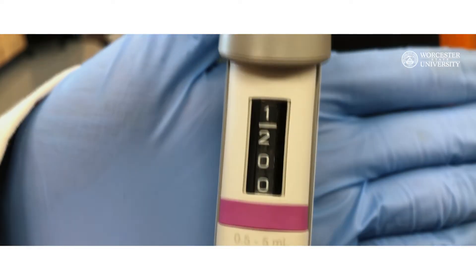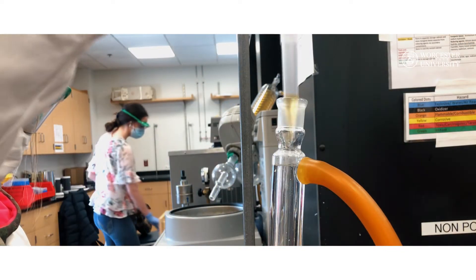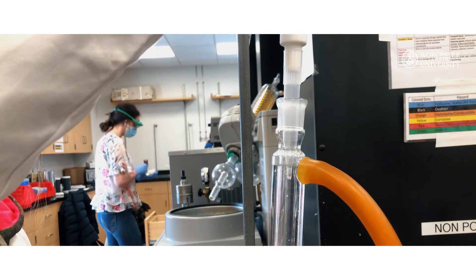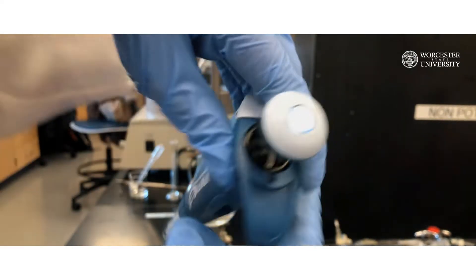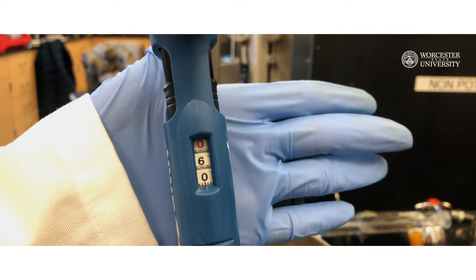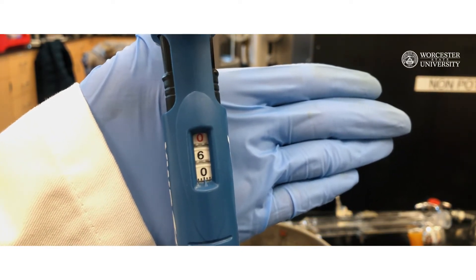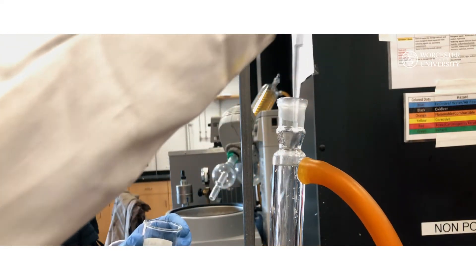Using a 0.5 to 5 milliliter micropipette, slowly add 1.2 milliliters of concentrated HBr through the open top of the condenser. If you don't have the 5 milliliter micropipette, you can instead use the 100 to 1000 microliter pipette. You will need to pipette twice, each time transferring 0.6 milliliters of concentrated HBr to the flask. If HBr sticks to the wall of the condenser, rinse it with a small amount of ethanol.